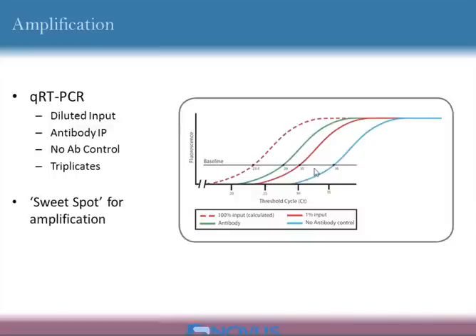And so when you're looking at your data here, you really want to make sure that you're amplifying before that early 30s and not in your late 30s down here. And the same for amplifying too early. Again, I said with the input, you will lose that nice standard curve and the nice triplicates if it's amplifying too early, if it's amplifying at cycle 5 or so.